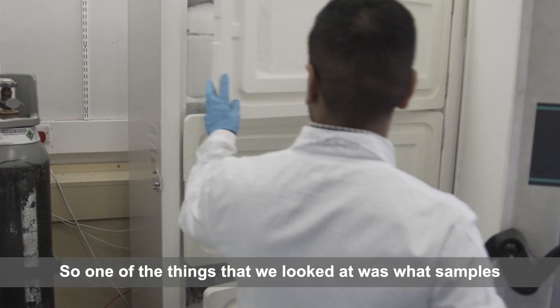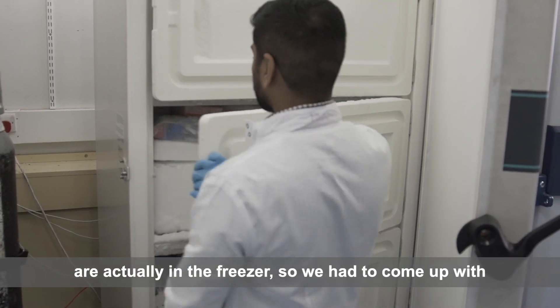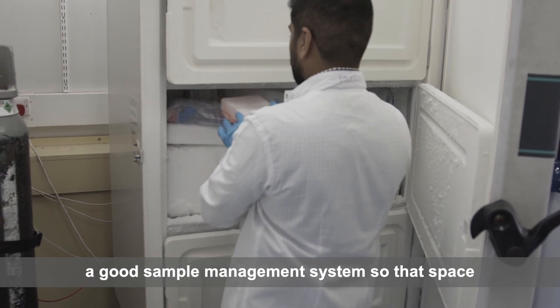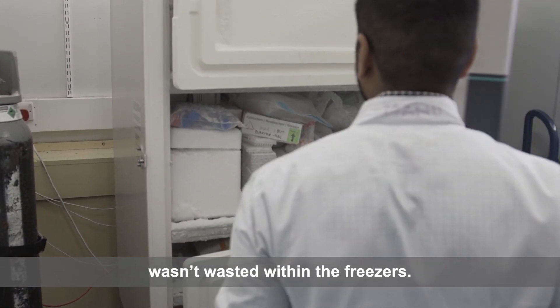One of the things we looked at was what samples are actually in the freezer. We had to come up with a good sample management system so that space wasn't wasted within the freezers.